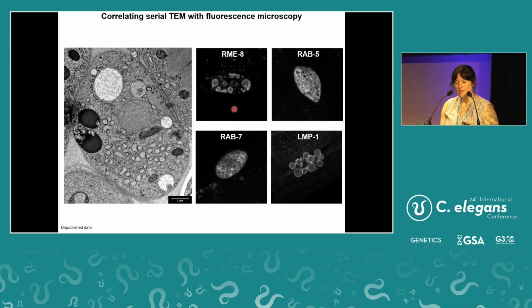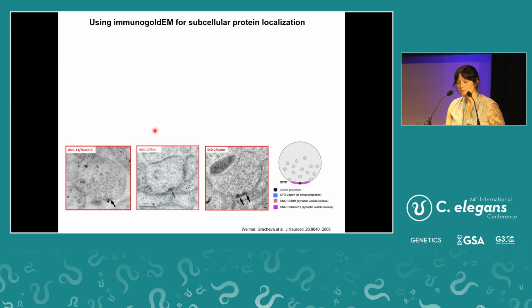And in this study, we're also using fluorescent tags, right? So we're tagging all of these proteins involved in the endolysosomal pathway with GFP, and we're looking at these expressions and these organelles in the coelomocyte, and we're putting together our EM data, and we're marking up these organelles based on essentially just their physical characteristics. And then we felt that we couldn't really be confident about how we were doing, maybe we're missing something, right? So we turned to a second EM technique.